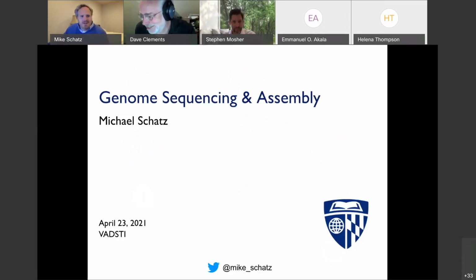Yes. Great. Okay. So today I'm going to be talking about genome sequencing. That's the process where we can read off molecules of DNA. Then I'm going to talk about a common analysis that takes place after that. With all sequencing technologies, we can't actually read entire chromosomes.